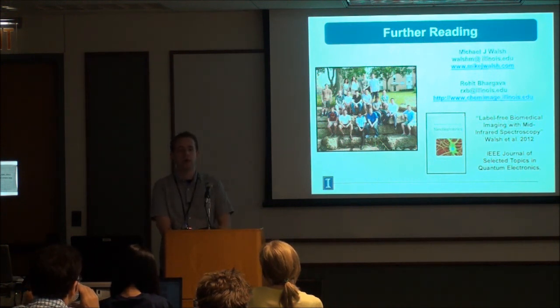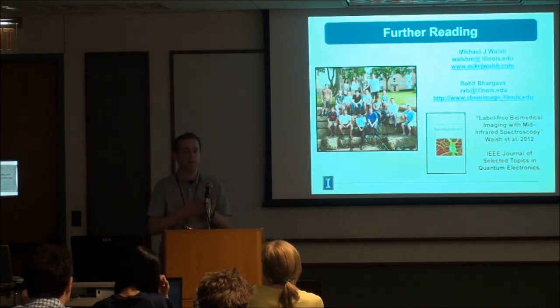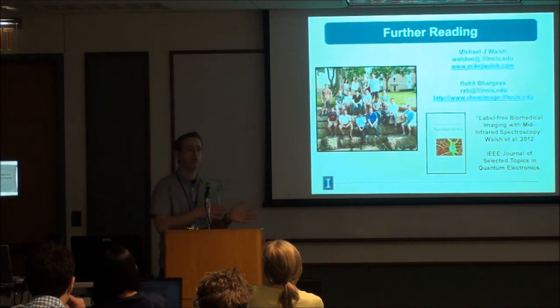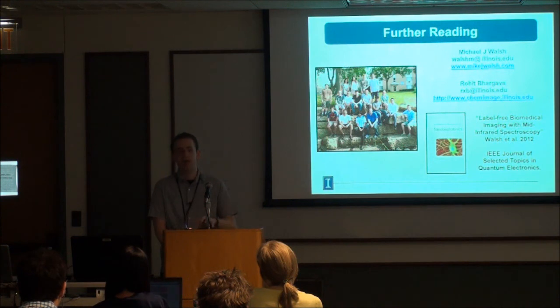A lot of this work, my next step is really to work with pathology to figure out what they want and in what format. It's all well and good doing this, but if they're like, this isn't useful or I can't use this, that's why things like the Bayesian approach are useful, because it removes the spectroscopy element. I have so many conversations where they get Raman and mix it with IR, so it has to remove any spectroscopy element. It has to be an image at the end of the day.